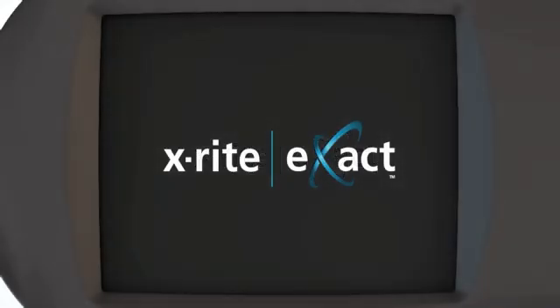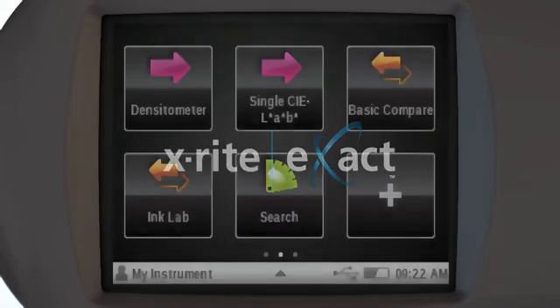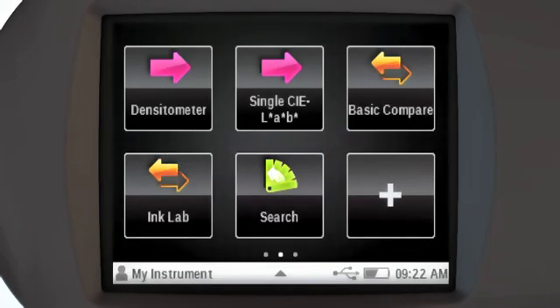The display of the instrument is a touch screen. When powered up, you see the main menu.